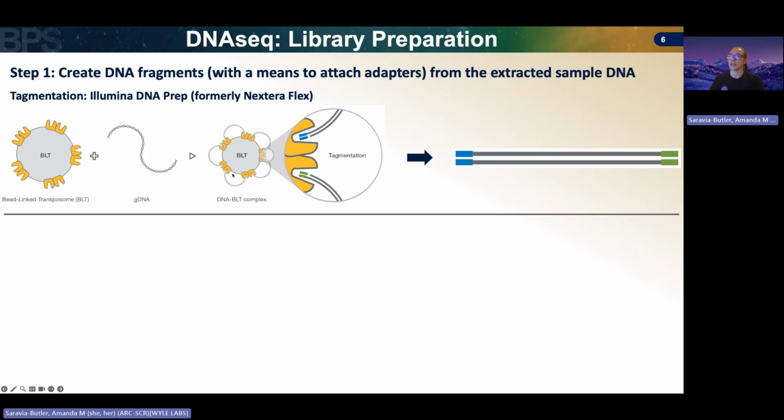So here in this technology, we are going to both cut the DNA into smaller pieces while simultaneously adding a sequencing primer onto either end of our cut fragments. So that's what you see here, our unknown in gray, and then our priming sequences on both the 5' and the 3' end in blue and green, respectively.